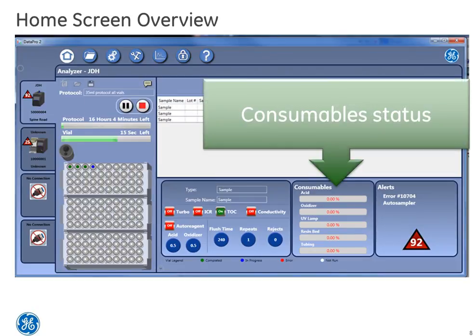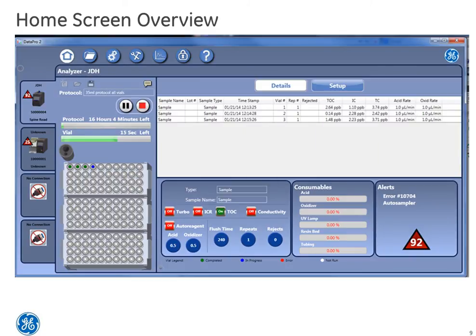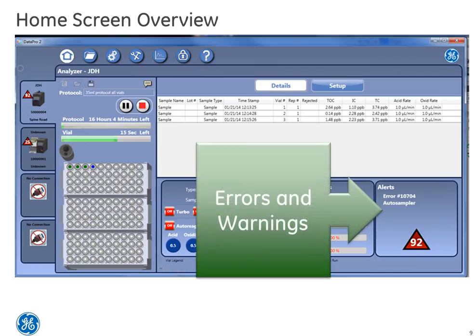To the right, you will see the consumable status display. And finally, the errors and warning icon. Both displays are critical for productivity of the instrument.